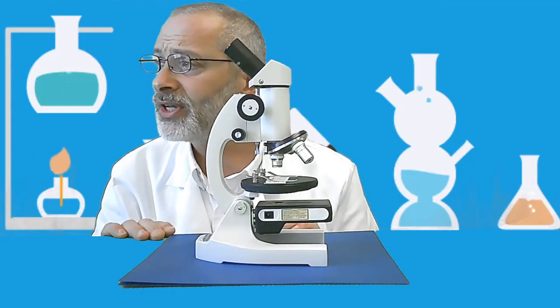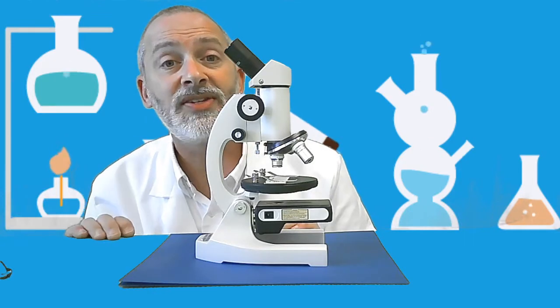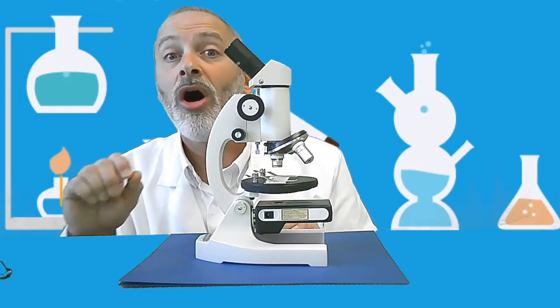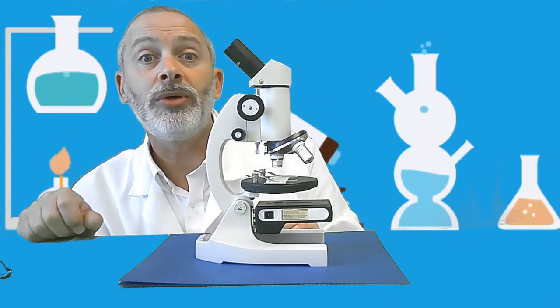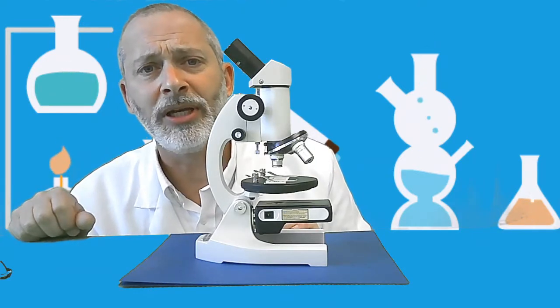Now, whenever using a microscope, if you wear glasses, you can take the glasses off because you don't need glasses when using a microscope because you are going to be focusing it for your eyes only. For your eyes only. That was a theme song to a James Bond movie many years ago.